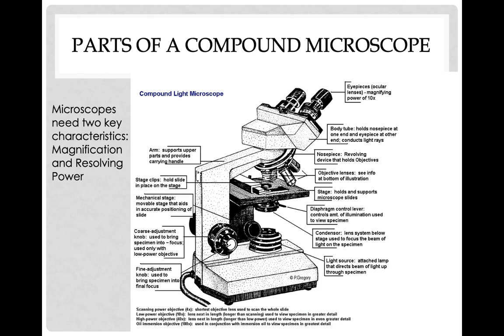But first things first, we're going to jump into one of the most important tools of a microbiology lab, and that's a microscope. So I'm going to bring the mouse on the screen here so we can talk about some of the pieces of this. Microscopes are really easy. Every single college or university or high school has one of these types of microscopes. This is called a compound microscope. There are lots of different types of microscopes out there. I've got a slide on that in just a second. This is one of the most common types of microscopes found in those research environments, schools, and things like that that I just mentioned.